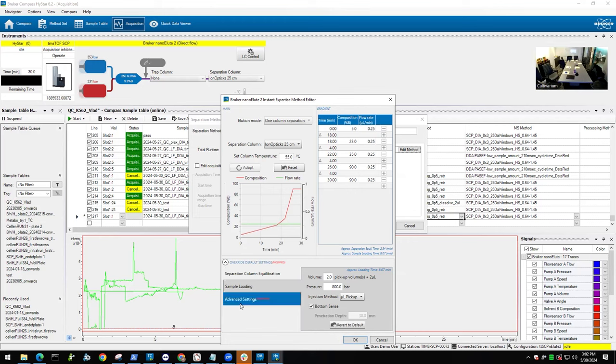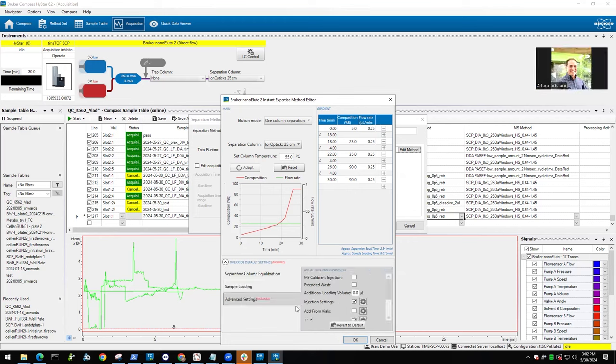Right. And then for pickups from 384 well plates, what we specify is a certain retraction height. The needle goes into the well, all the way down to the bottom, recognizes it's the bottom of the well, and then it retracts typically by 1 millimeter. But that's too much for the 384 well plates. The sample is right at the bottom, and you only have 1 or 2 microliters. So if you go up 1 millimeter, half of your sample won't be taken because the needle is too high. That's why we say 0.5, and 0.5 is typically good so that you take the entire sample.